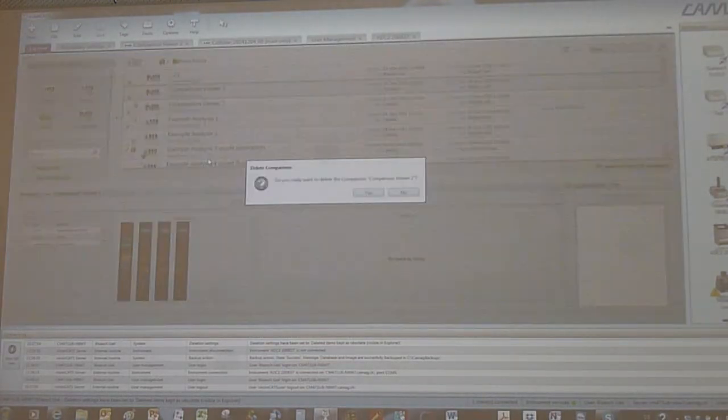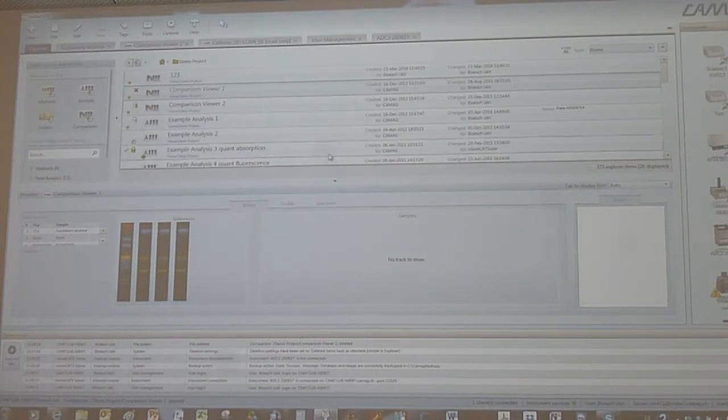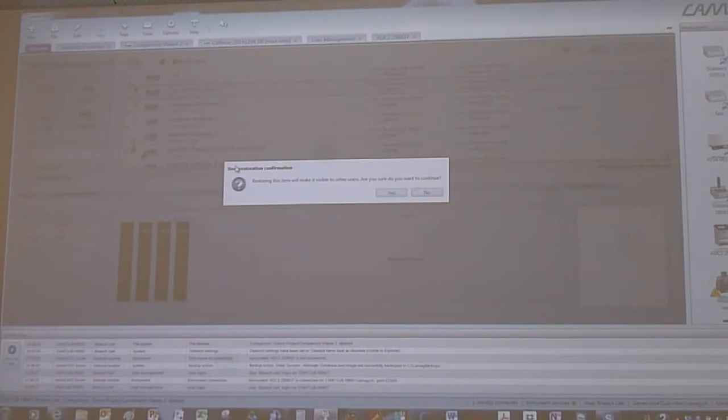If I now delete, do you really want to delete? It is deleting it. And now, as I said, I want to show it is still here, but I see it is deleted. I could now move this to a folder for deleted files, if I wanted to. If it is in this stage, I can still say, okay, restore. Yes, I will restore it, and data is fully here. So with that, data is fully available.